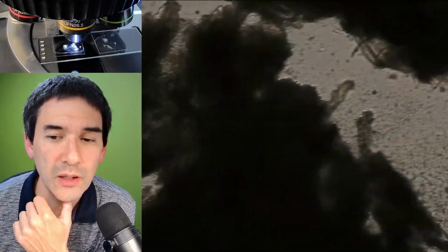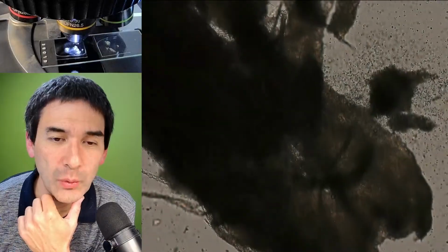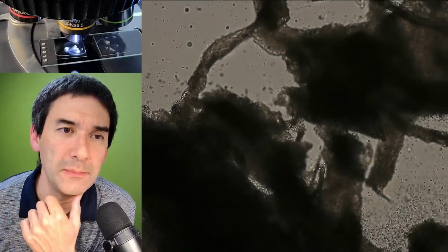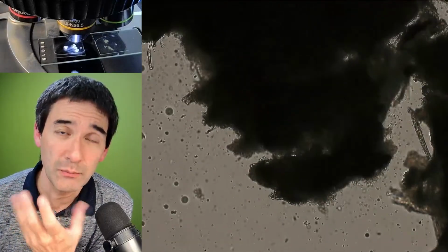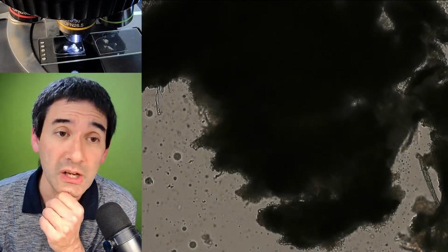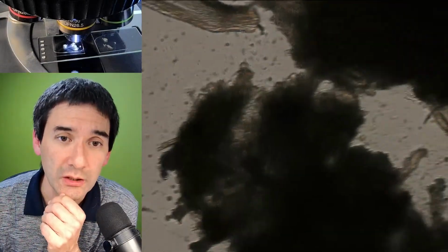And what I think I would do is, now polarization is the following. Many substances, especially if you have such a mix of different things in here, start to depolarize. So basically, even if you have some other object in there and the polarized light jumps to it, it depolarizes it, and you still see it shining on a dark background. Even fibers change the color around, but sometimes I found it a little bit difficult.